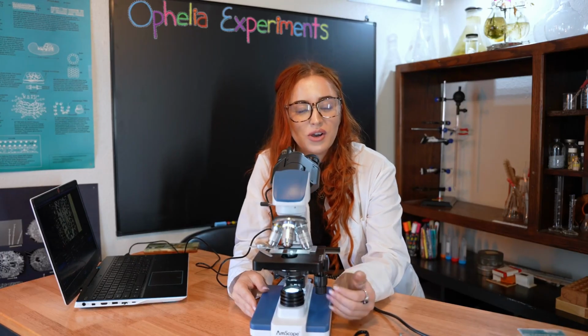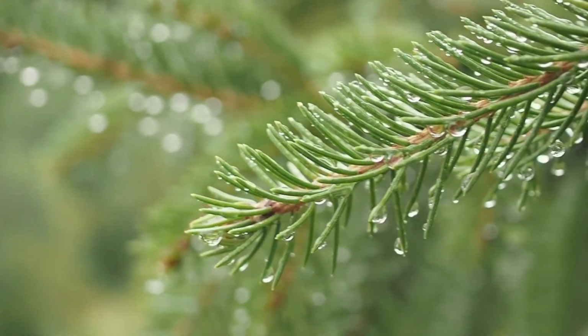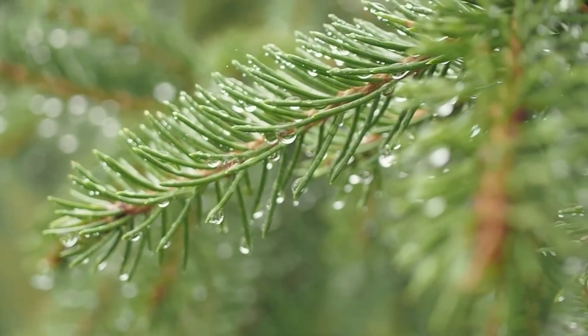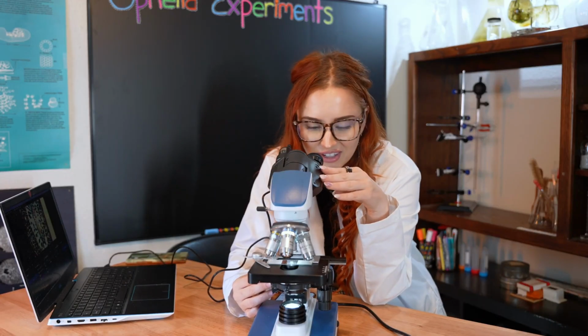All right, so a pine leaf, or more accurately described as a needle, is a marvel due to its shape and evolutionary design. So let's take a closer look and try and get it into focus. Yeah, this is one of the prettiest things I've seen under a microscope.